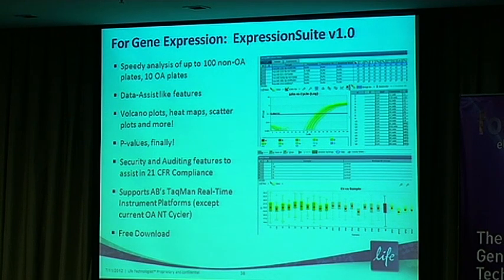Are you going to one by one click your mouse and look at the amplification plot one by one by one? Right? That gets incredibly tedious. The whole point of looking at large sets of biomarkers is to actually get a profile. Right? So we have heat maps built into the software where you can just do a very quick heat map analysis and allow the software to actually segregate all your samples.